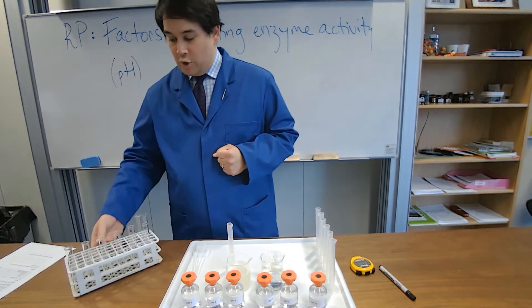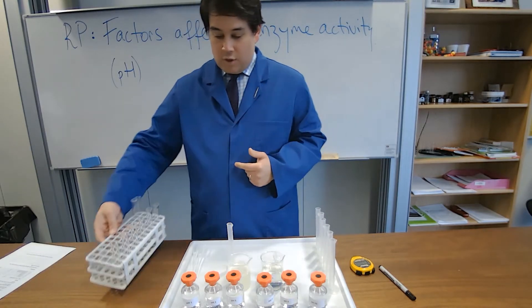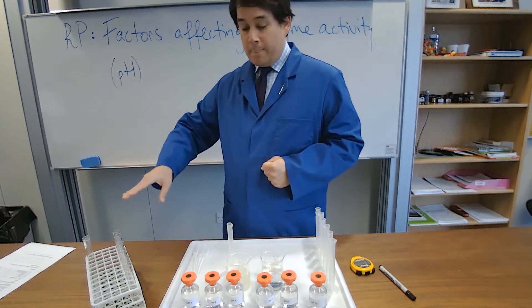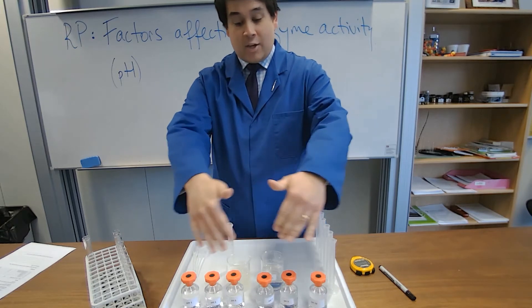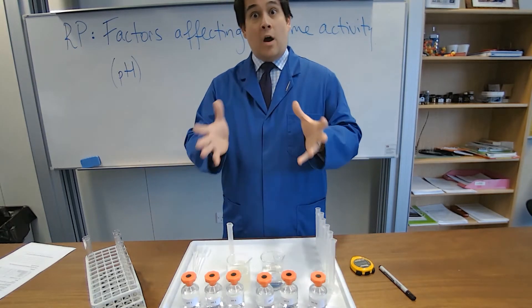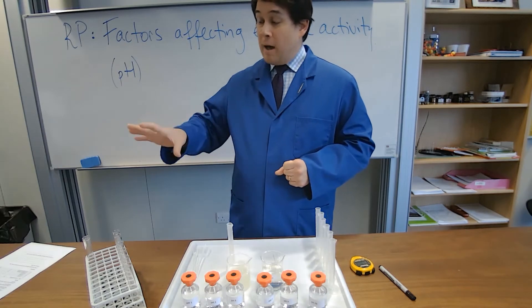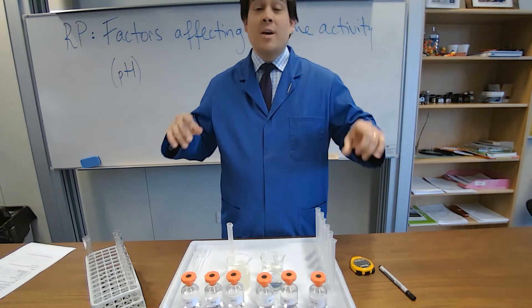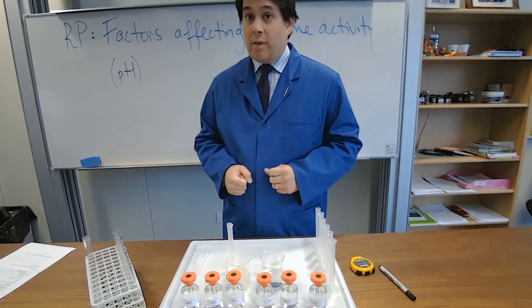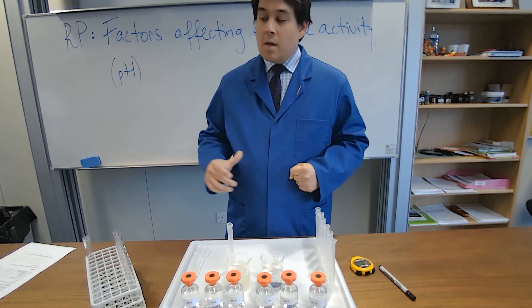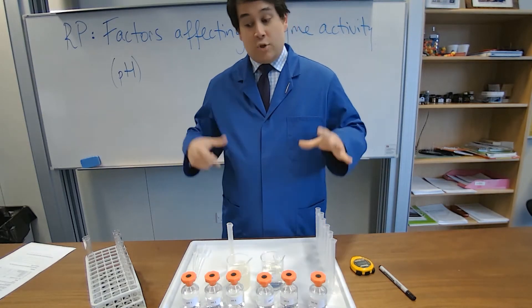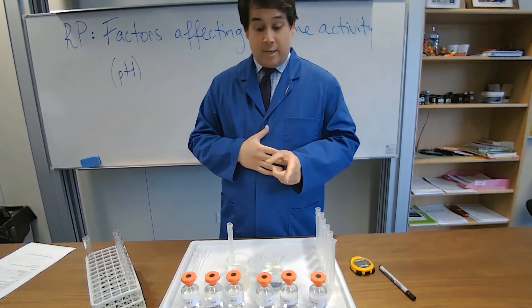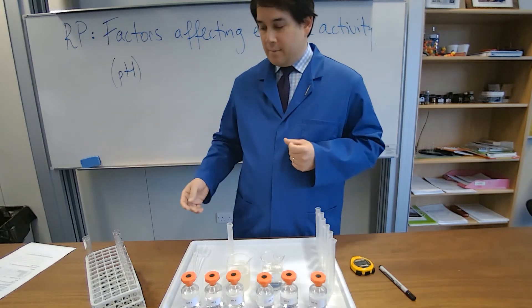So what I've got here are test tubes labeled with the different pHs. What I'm going to do is add the substrate, the albumin, into each one. I'll add the pH buffers into each one as well to make sure that they are of that pH. I'll then put them into a water bath, given the chance to acclimatize to be at the same temperature, because we know that temperature is another variable that affects enzyme activity. So we're going to keep that constant. We're going to keep all the volumes constant of course, and then we'll crack on and add the pepsin and see how that affects it. Here we go.